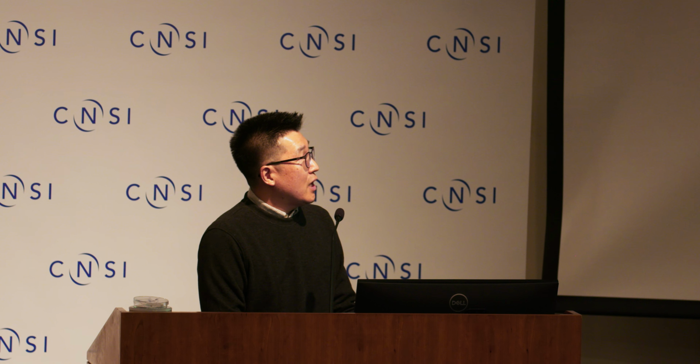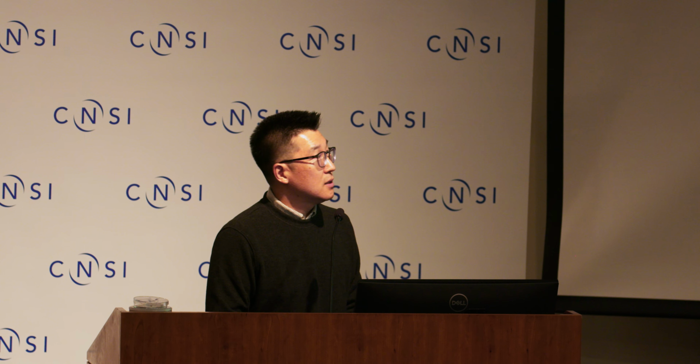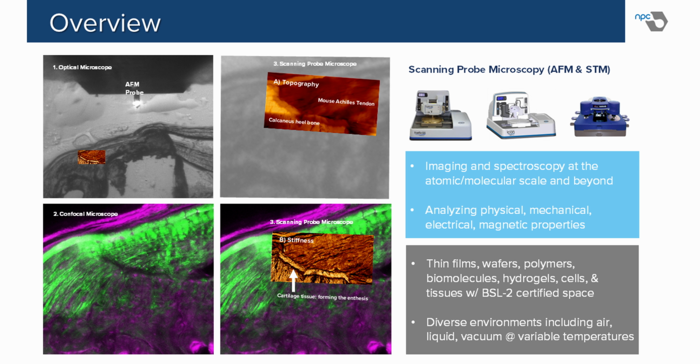Another advantage we want to highlight is biomechanics. So we have a bio AFM, called the NanoWizard, integrated with confocal microscopes. So this bio AFM is specialized to take three different types of images. The first one is optical images, then confocal images, and then scanning probe microscope images.